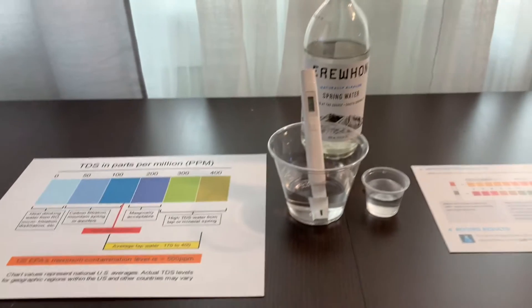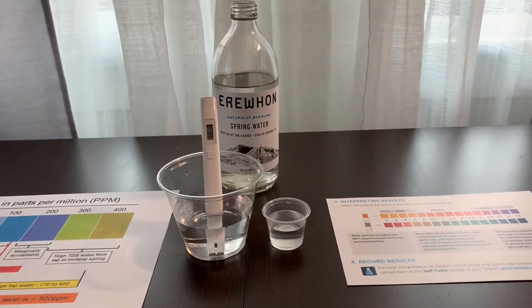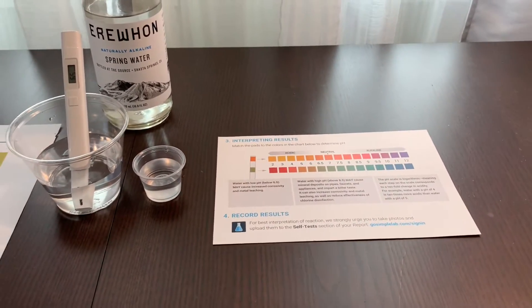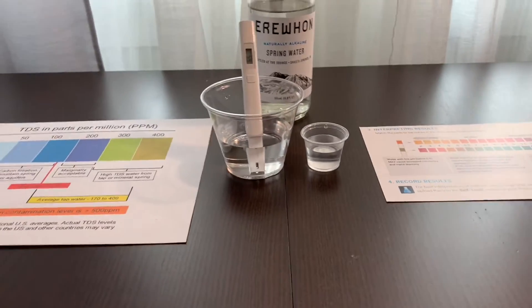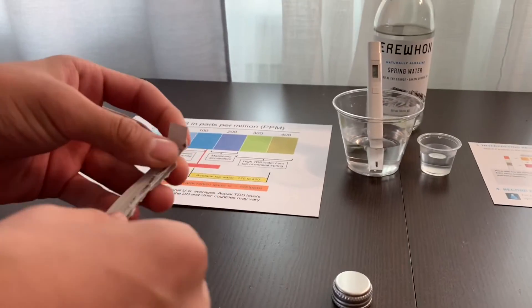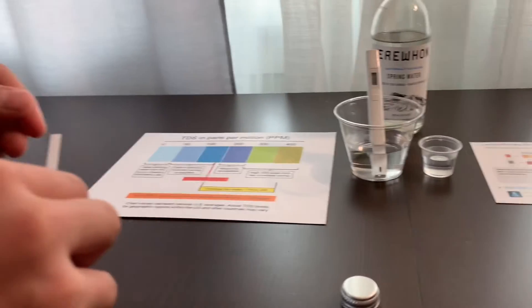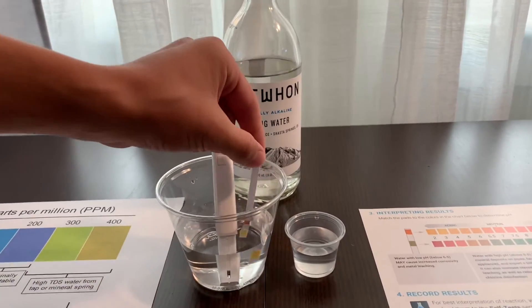Now, let's test the pH level. For the pH, I'm going to use SimpleLab pH test strips. First, we need to open the package. Then, we need to take it out and place the strip in the water for ten seconds using a gentle back and forth motion.